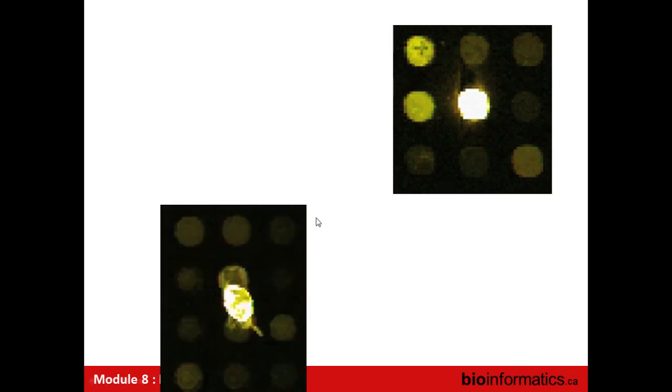By contrast, this is probably a terrible thing. Some sort of a dust mote here is impinging directly on two spots. There's no ability to distinguish this spot and its fluorescent ability from that spot, and essentially you're seeing a large introduction of noise.